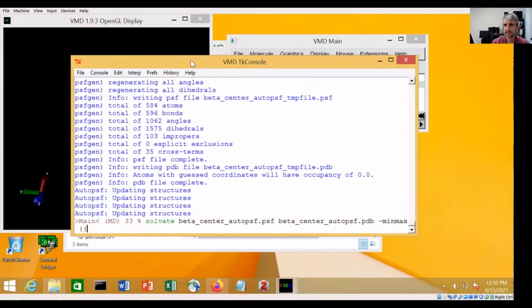And here I need to give the vectors or points that represent the farthest extent of our box. So if we want it to be 50 by 50, this should go from -25, -25, -25. So those are the X, Y, and Z positions of the bottom left outward corner, and then the top right inward corner is going to be 25, 25, 25.